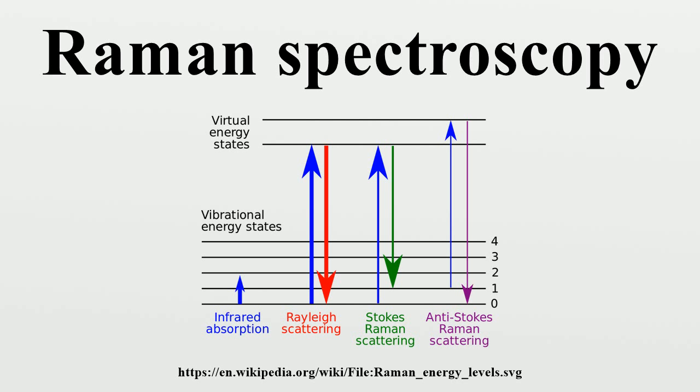If the crystal structure is known, Raman spectroscopy is the basis for distributed temperature sensing along optical fibers, which uses the Raman shifted backscatter from laser pulses to determine the temperature along optical fibers. Raman active fibers, such as aramid and carbon, have vibrational modes that show a shift in Raman frequency with applied stress. Polypropylene fibers also exhibit similar shifts.